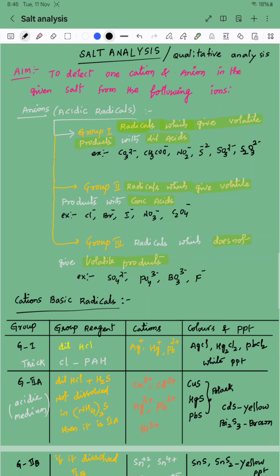So doing cations first can make anion identification impossible, because the cation reacts with the reagents, and then those reagents cannot be used for the identification of the anion. That is why we do the anion test first, followed by the cation test using different types of reagents, right?